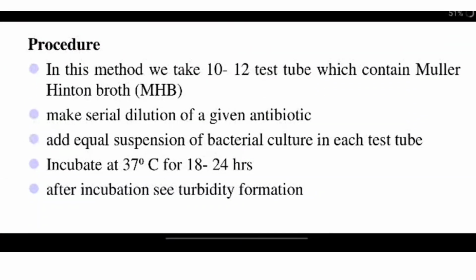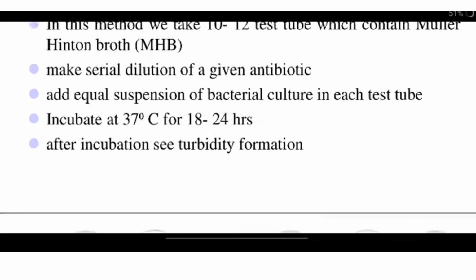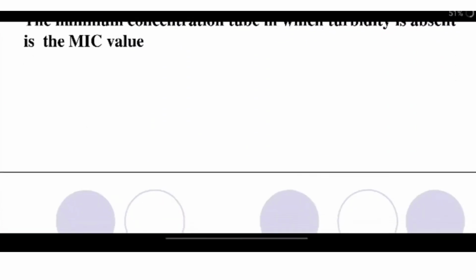add equal suspension of bacterial culture in each test tube. We will incubate at 37 degrees Celsius for 18 to 24 hours. After incubation, we will see the turbidity formation.